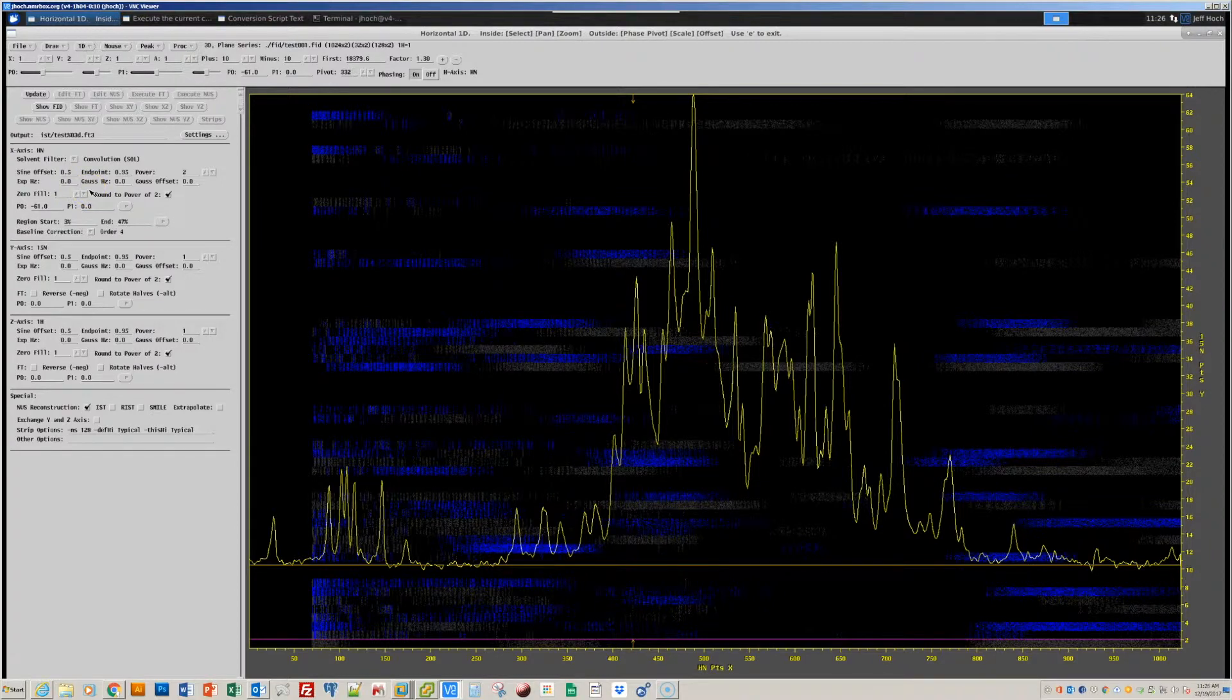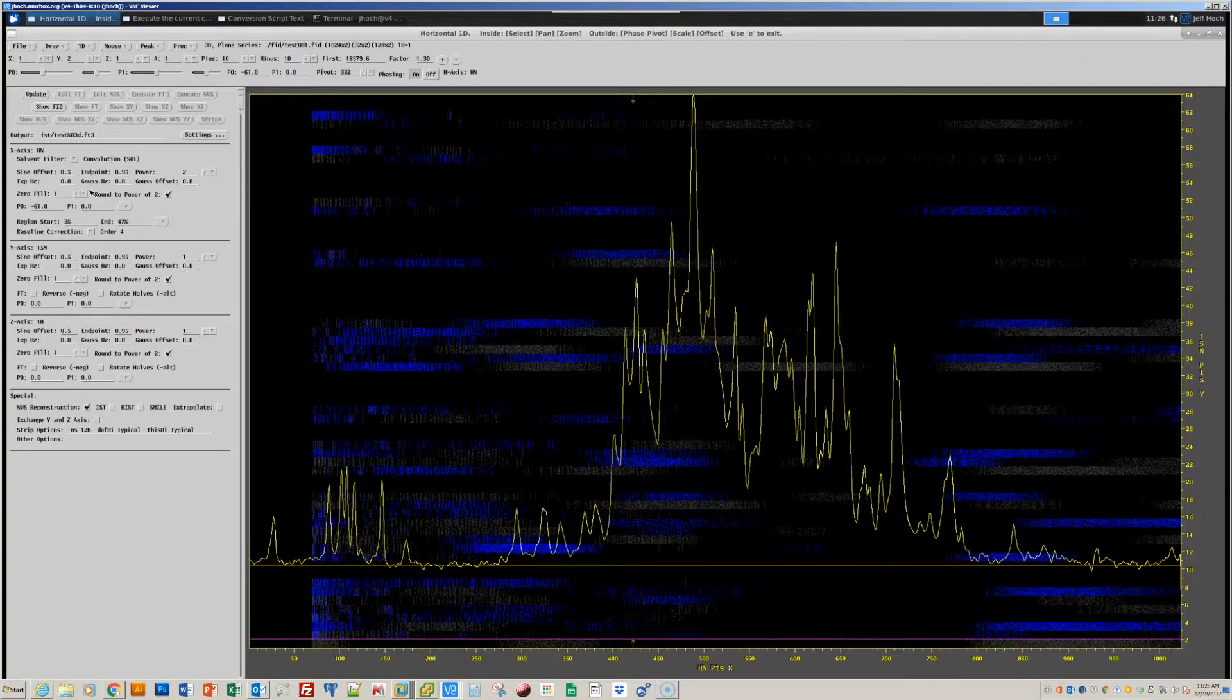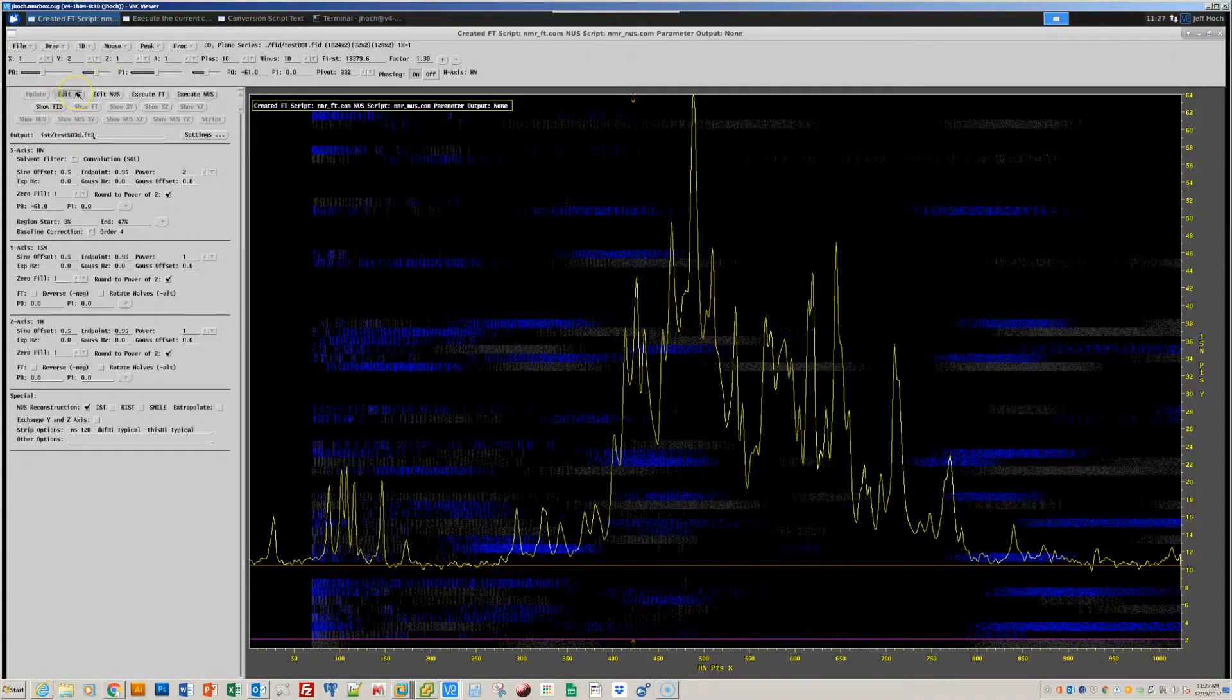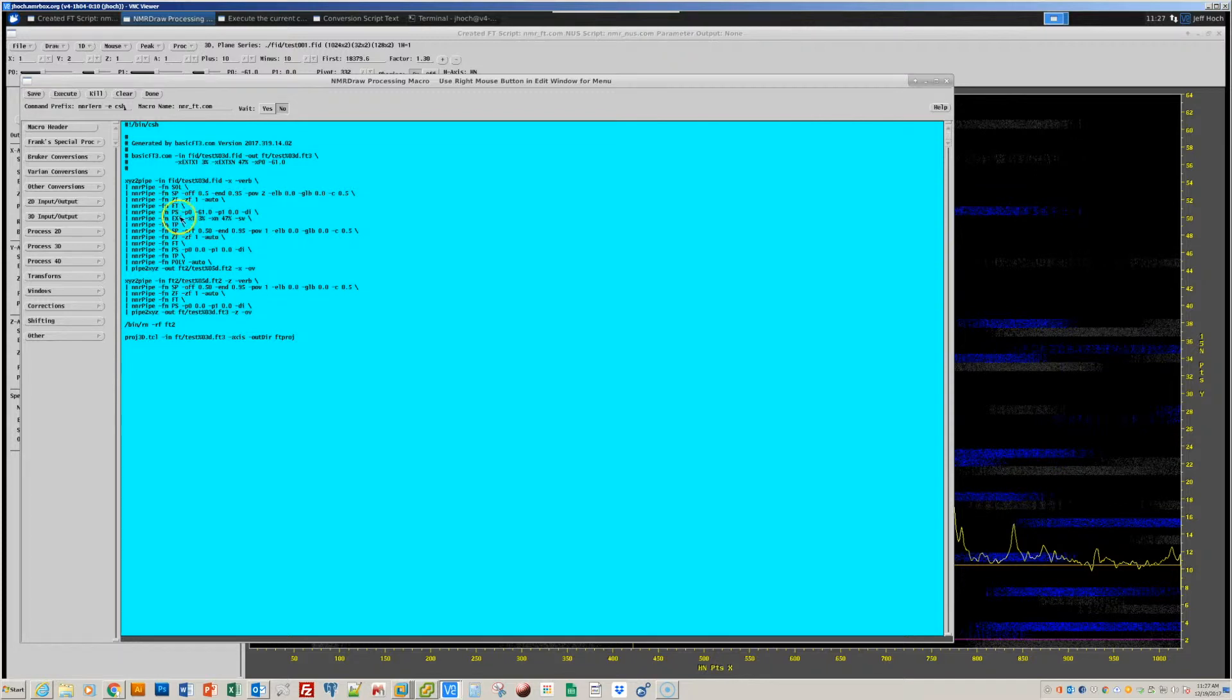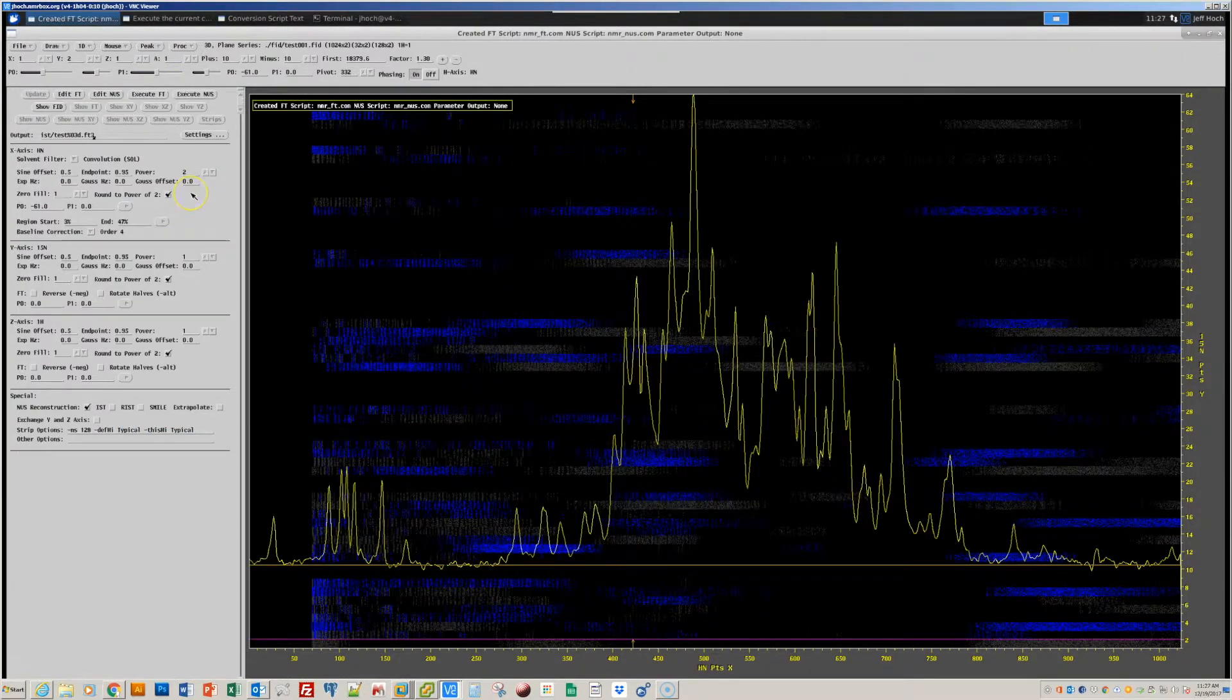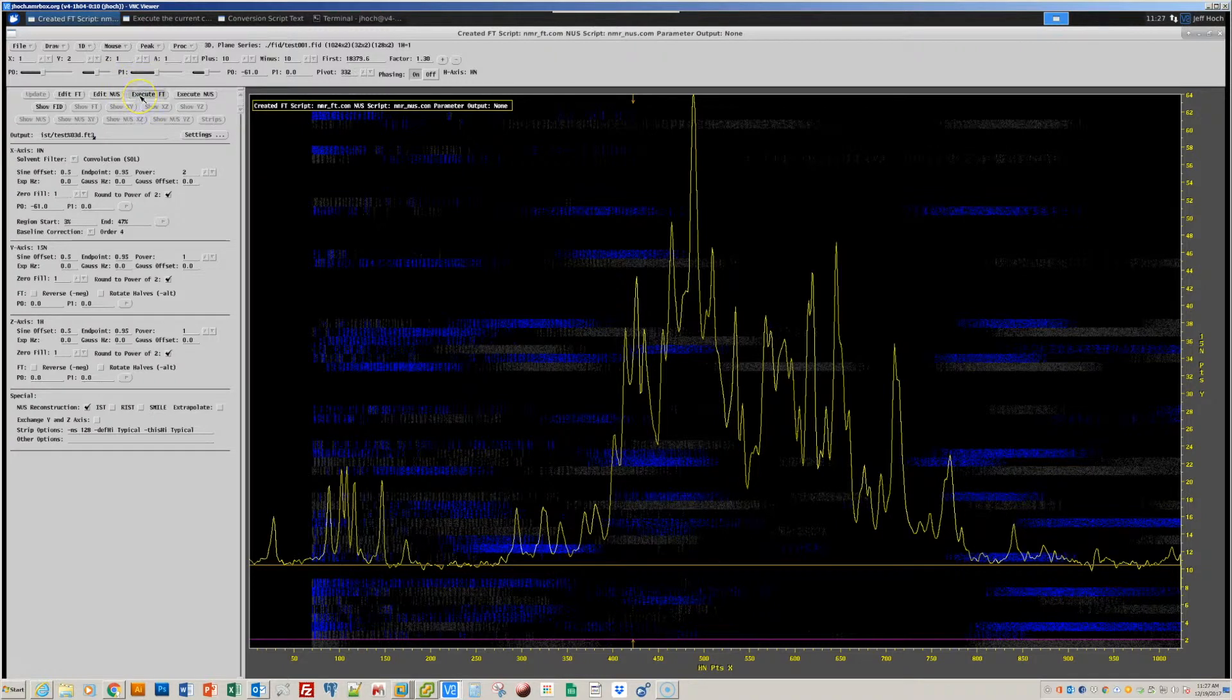So, in a typical workflow, we recommend that when you work with non-uniformly sampled data, that you do a complete ordinary FT of the data, so that you can first establish that phase correction and Fourier transform options are set correctly before you process the spectral data. So that's what we'll do. I'll press this button that will create a processing script for this spectral data, and there are buttons in this interface. The Edit FT button will let us see the script that does a regular FT on this non-uniformly sampled data. And in this script, you can see the script generation command, in this case basic FT3, that was used to generate the processing scheme, and then the processing scheme itself. So that's been generated automatically, and now I can execute that Fourier transform scheme with this button, execute FT.